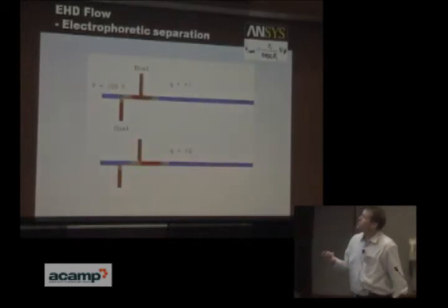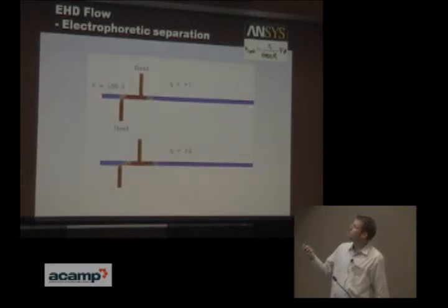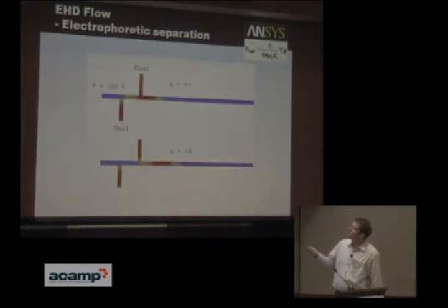Then we can switch the voltage drop to go from basically the east to the west side arms, and do a separation. Now we're seeing separation based on charge. Okay, so we have a low charge, charge equals 1 compound, and a charge equals 2 compound, and the one with the higher charge is moving twice as fast as the one with the lower.